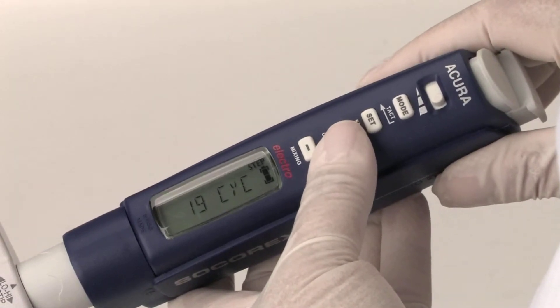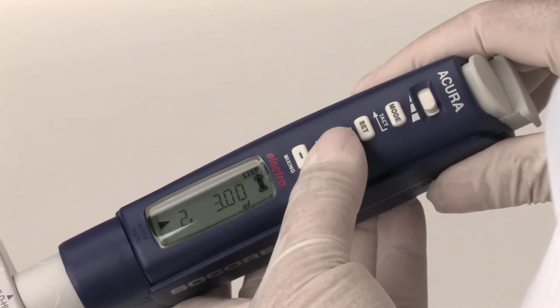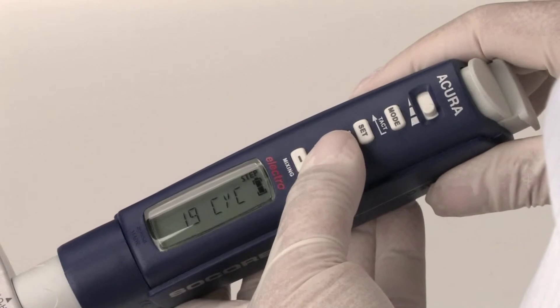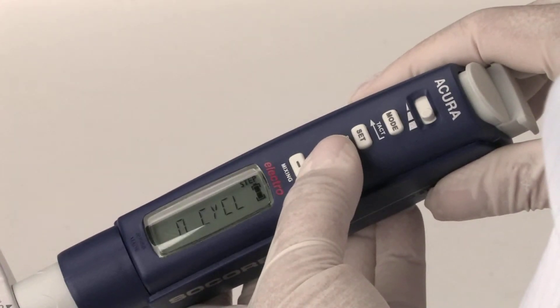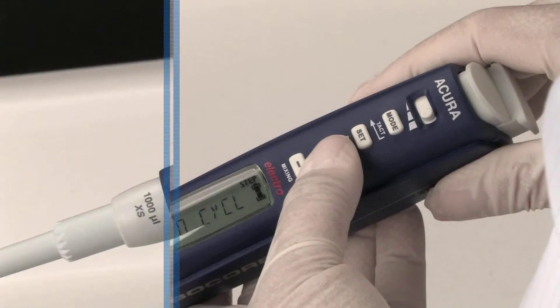The cycle counter displays the number of cycles performed since the counter unit was last reset to zero. Consecutive aspiration and dispensing are counted as one cycle. It enables maintenance and calibration tracking or may be used for any other purpose.